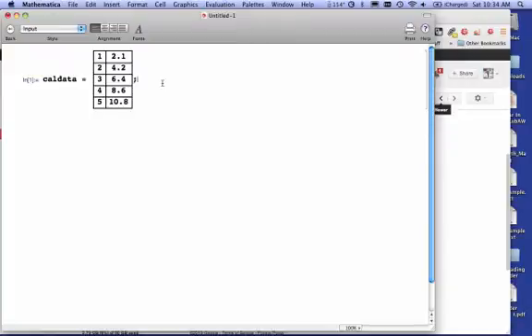So here's some data, I'm calling it CalData, and this is data that I've collected in the lab, and notice it's in XY format, so X is 1, 2, 3, 4, 5, and Y is roughly 2, 4, 6, 8, 10.